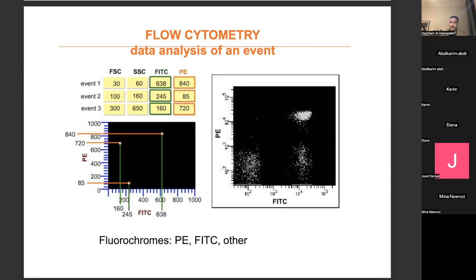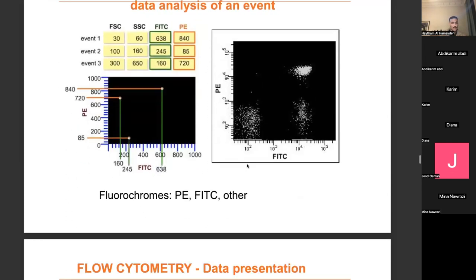We're basically calculating the number of those cell types in our cell population. These cells have that, these cells have that. That's what comes out of the fluorescence. The fluorescent is binding to CD3 or CD4, and we separate the cells according to what they have using flow cytometry.